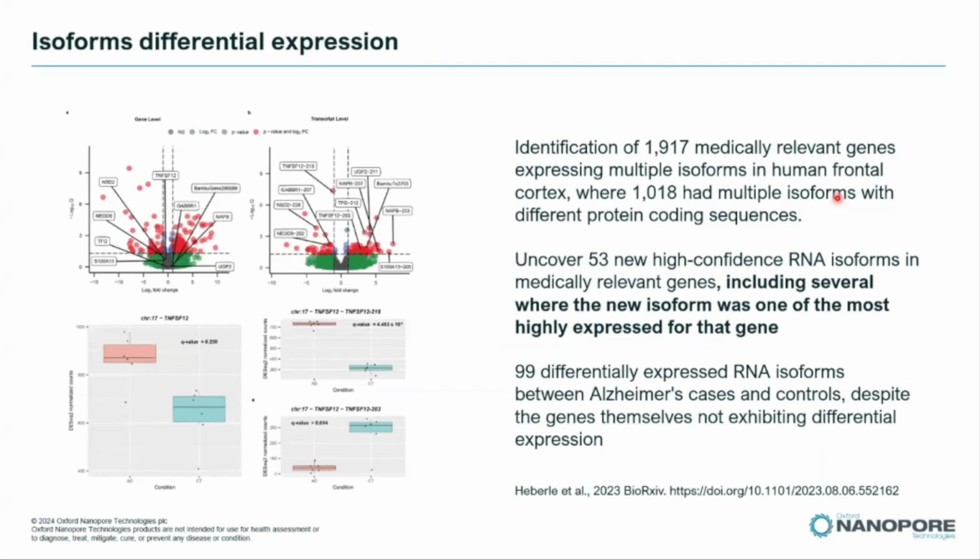Lots of publications exist using long-read sequencing, and I've already shown the utility of this in transcriptome analysis. You will see that most of the publications that we are showing are very recent, because this is really a recent trend. But authors and researchers are rediscovering, or discovering, the interest of those long reads.